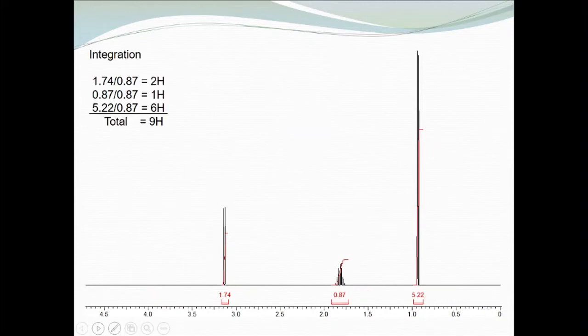So writing that up in the corner there, we have a CH2, a CH, and likely 2 CH3. So at this point, we know something about our structure already. Whatever this is, it has 9 hydrogens, which would mean this is likely a butyl bromide of some sort. And here we have the actual fragments written above the pieces.